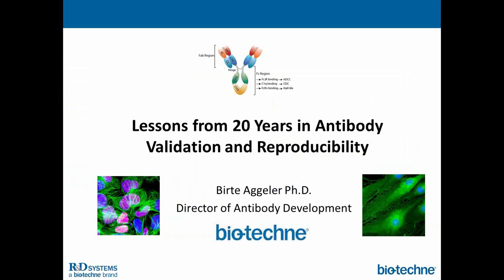So any application that requires a folded protein has a tendency to work on the same clones versus a Western type of application. Some of our best Western antibodies aren't necessarily the best assay targets, and the reverse, even within the same panel. They've all seen the same exact immunogen, and even with that, you will see that split a lot of times.